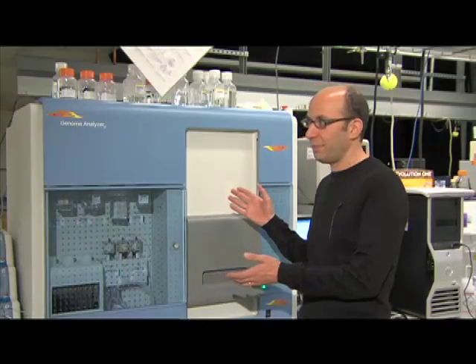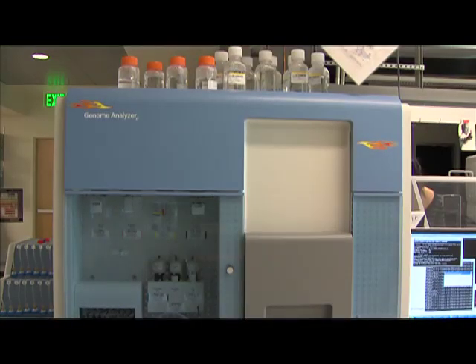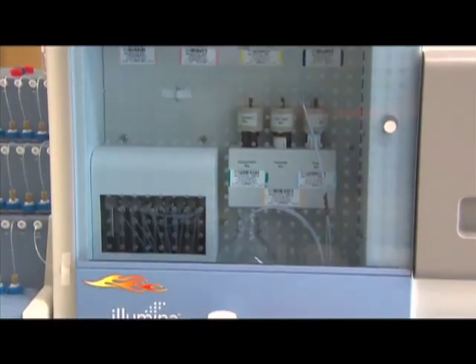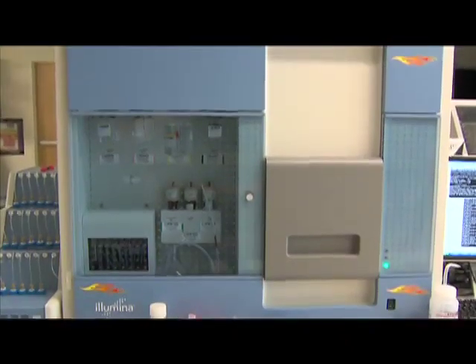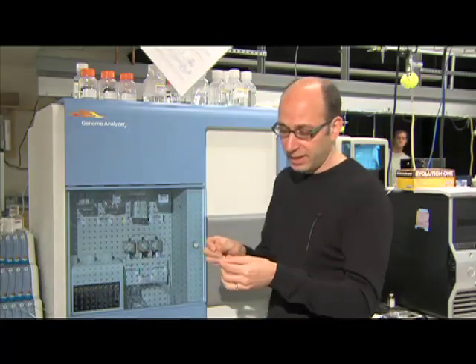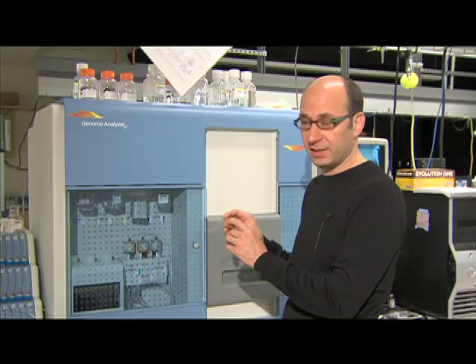So here we have an example of a next generation sequencing machine. This one is an Illumina machine, the type I talked about. You can see it's sort of on the same physical scale as the capillary electrophoresis, and maybe naively looks very similar, except perhaps more tubes. The difference is, instead of separating pieces of DNA based on their size, the reactions are carried out, as I diagrammed, on a slide. And this is the actual size of the slide. Just a remarkable thing is that one's able to carry out 100 million different sequencing reactions on this slide.